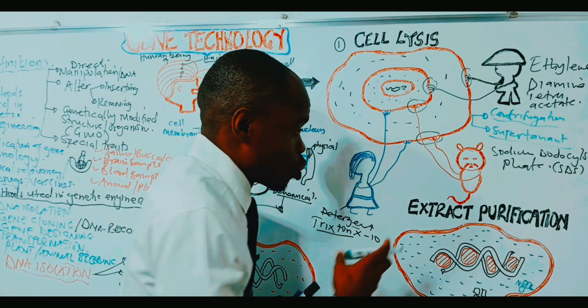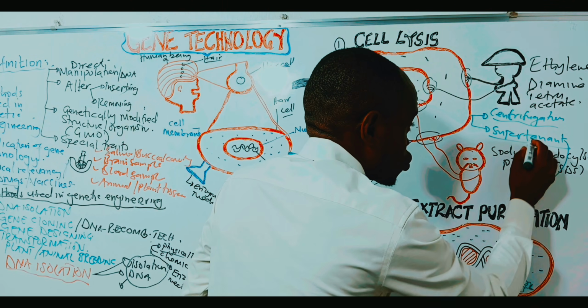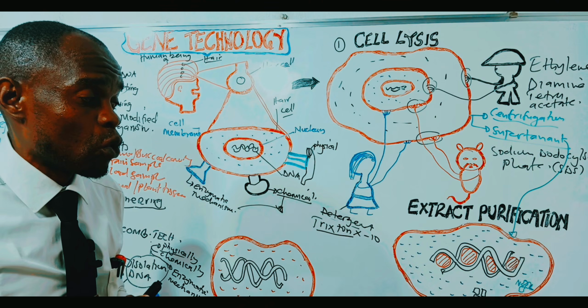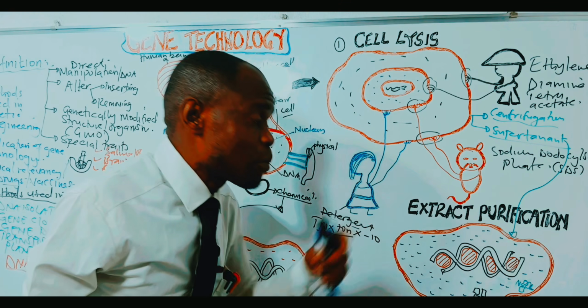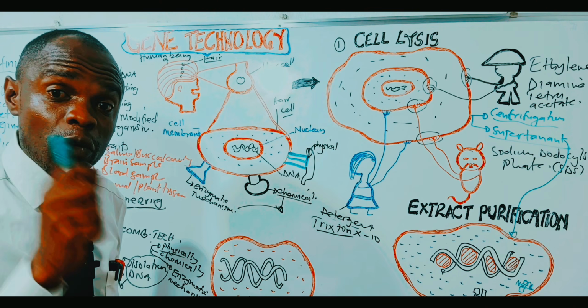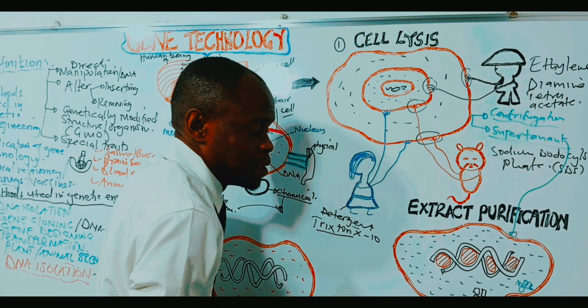So what we are having here is the supernatant, which is going to undergo purification now. We want to begin removing those unnecessary components. What are we going to do, members? How can we purify? Because our focus is to isolate the DNA only.